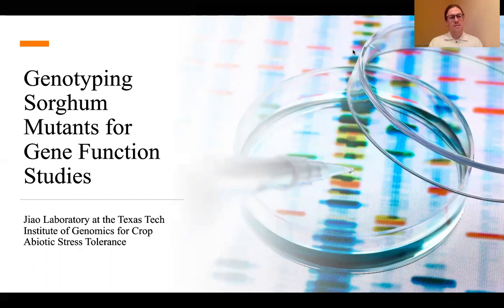My presentation today is about genotyping sorghum mutants for gene function studies.